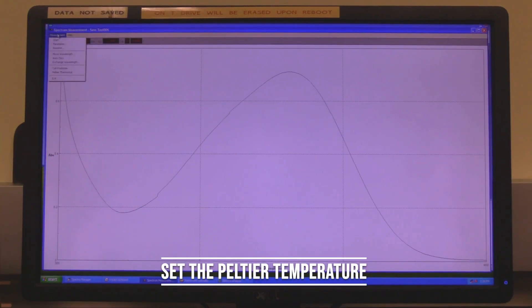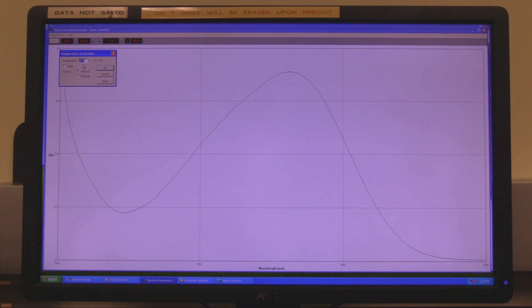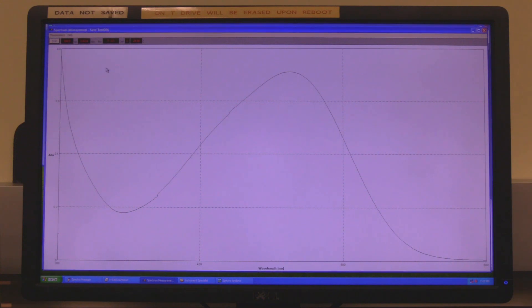Set the Peltier temperature. In the measurement window, click on measurement and then click on Peltier temperature. Input the desired temperature, then click on apply and then on ok. The temperature will start to change.